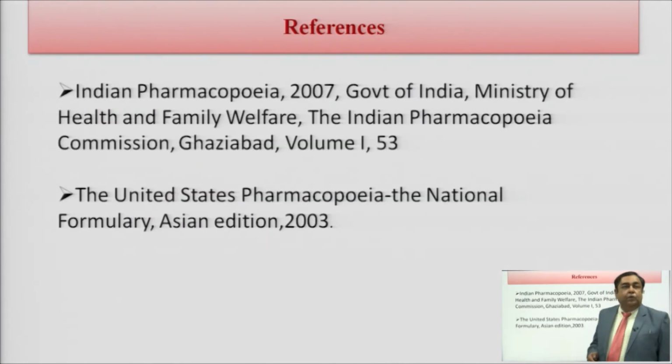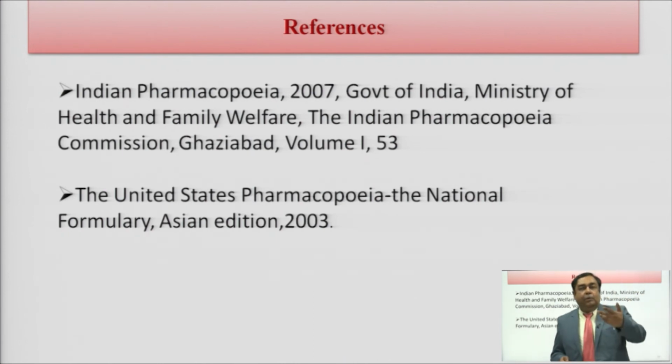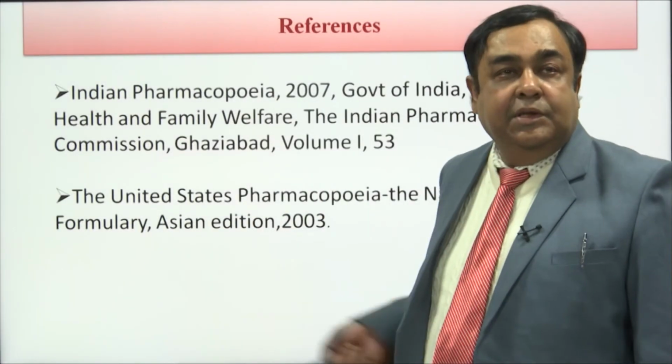You will have to refer to Indian Pharmacopoeia and United States Pharmacopoeia. Now, I will be showing you two videos which will give you a very clear idea about how it works in industry.